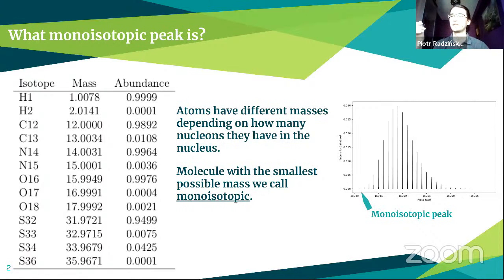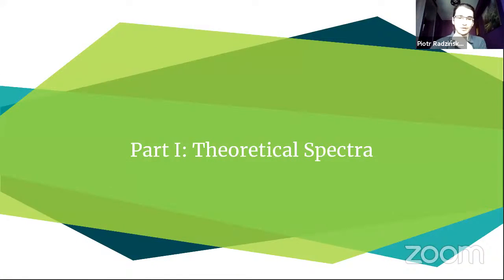However, it's very important to classify proteins, and that's why we try to predict it better than the previous works do. And we begin with only theoretical spectra, because they are perfect mathematical objects, and that's why it's easier for the beginning.